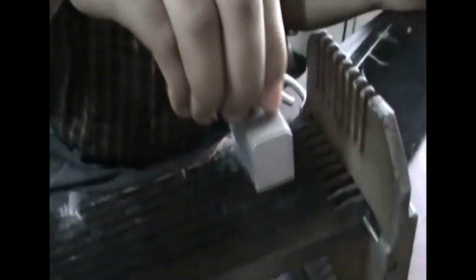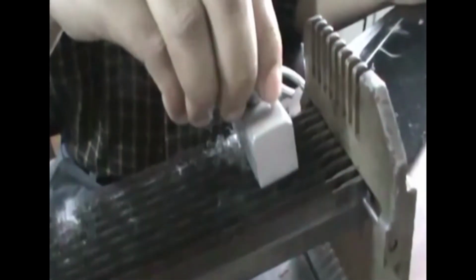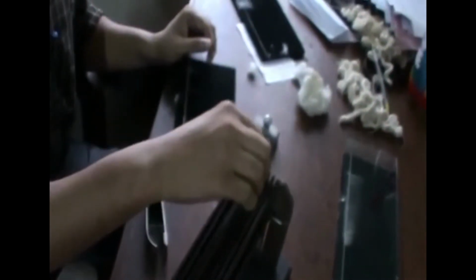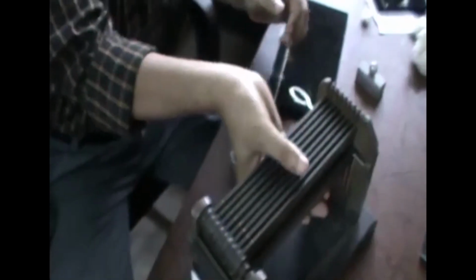This process is repeated until all the sample of lint is transferred to the left hand side of the sorter. During this process, any neps in the sample are removed and preserved on the velvet pad. The sorter is then turned around so that the front of the instrument faces the operator and the longest hair projects towards him. The top combs are placed in the rack so as to grip the tuft and prevent uncontrolled slipping of the hairs. The hairs are pulled out in tufts by means of the grip, the longest first, the combs being successively dropped as required.